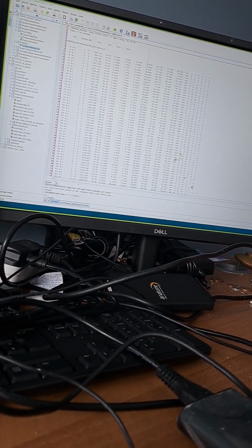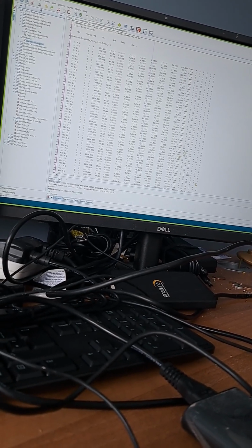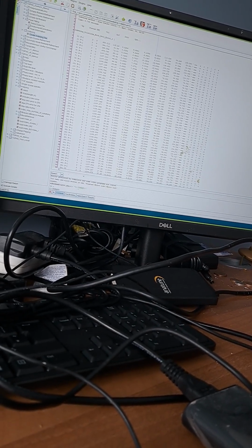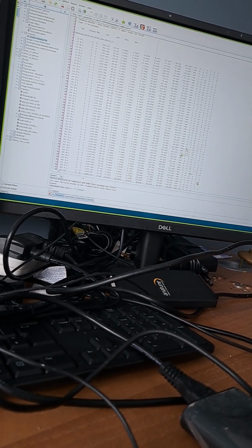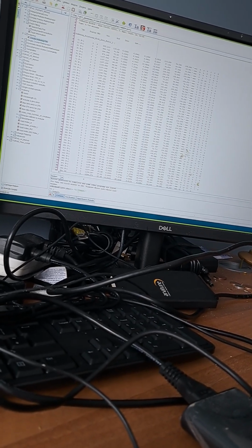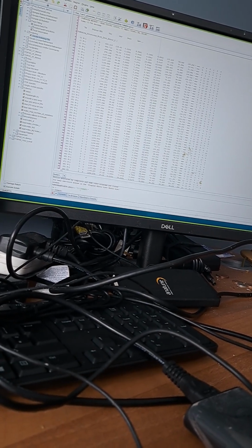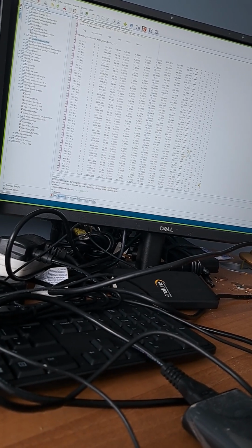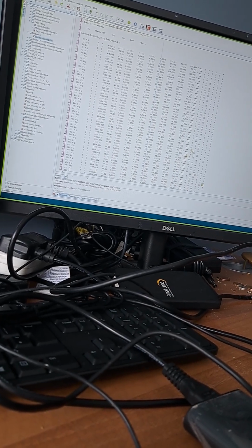Now, I think there's also water potentially present in this, given the volumes. So it may be that you want to put in 2, 3, 4 water molecules. Again, put in any hydrate structure, anyone at all, and then delete the pharmaceutical, leaving you with the water. And you might need to input, so the water itself will have a Z matrix. So if you can open the Z matrix file. Okay, so I can quickly show you how to do that.